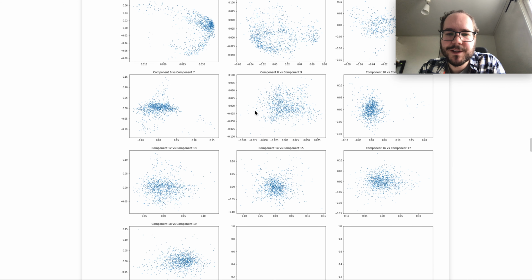And you can see that most of these capture quite a bit of variance, and it's around here, so 8 to 10, where you see that maybe there's not so much structure anymore. It's more like a Gaussian distribution. So you could see this as a normal distribution in 2D. In a normal distribution, you would see this bell curve. And here you see that this also happens with one region where values all tend to cluster together, and it becomes much more sparse going outwards. And this is usually an indication that you start to capture less useful information here.